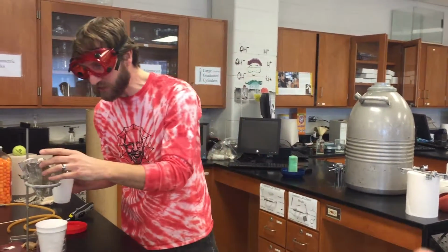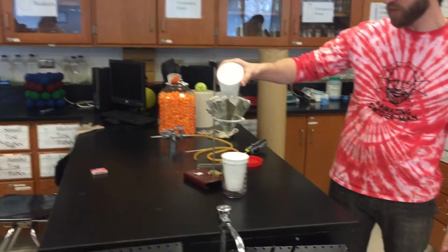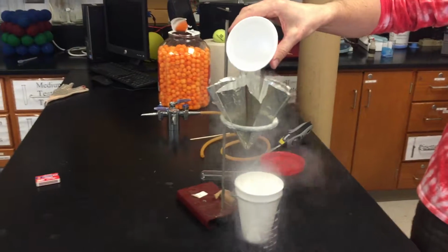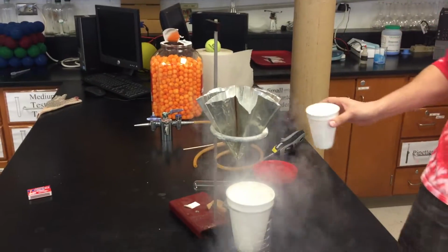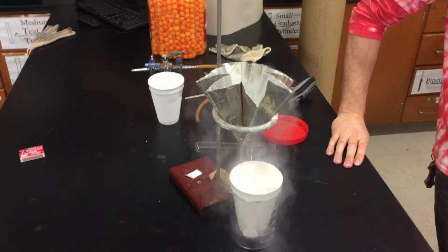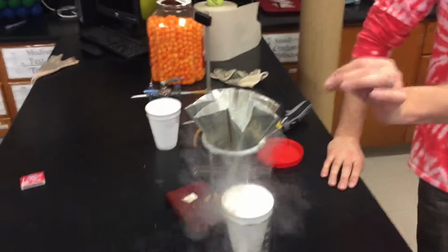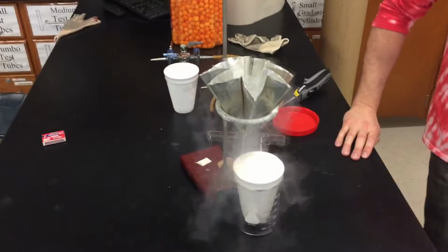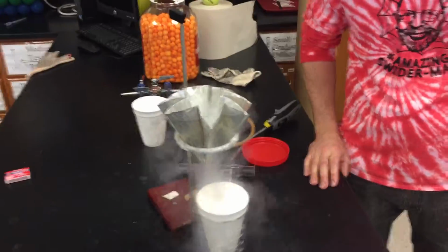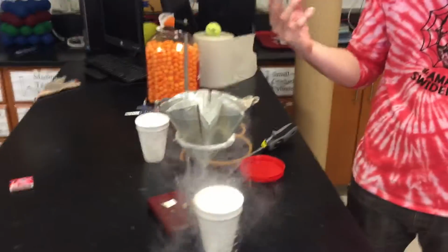Okay, I'm going to pour it into this little weird shaped cone that I've made over here. It's made out of metal. And what you can see coming off the top is what? Vapor. You can't actually see nitrogen when it's in the gas phase, right? There's nitrogen in the room around us right now and you can't see it. What is this stuff? It is water. It's moisture from the air that we can't see either.